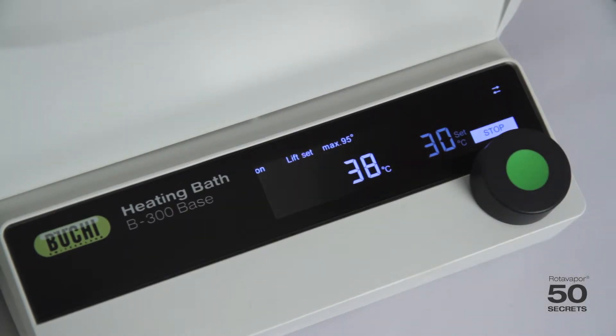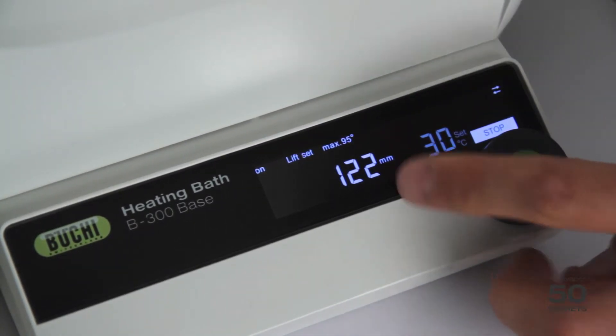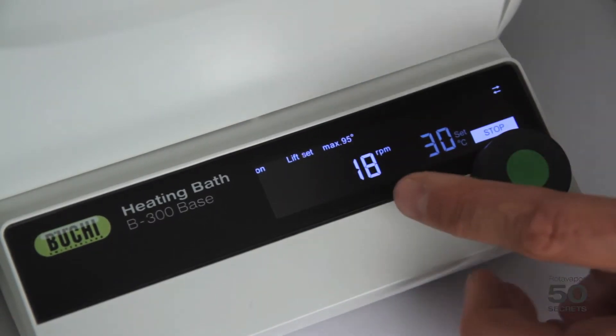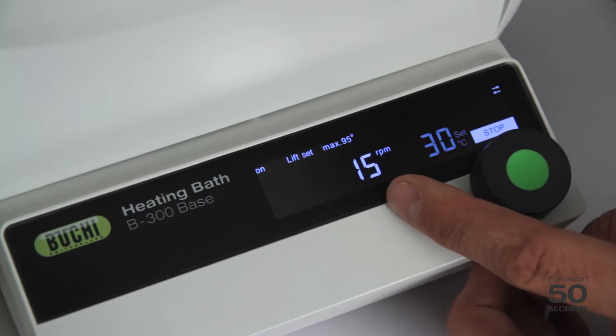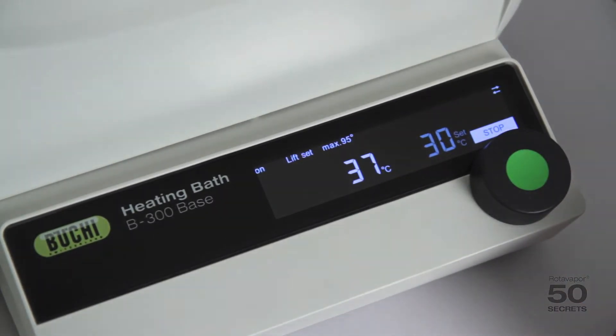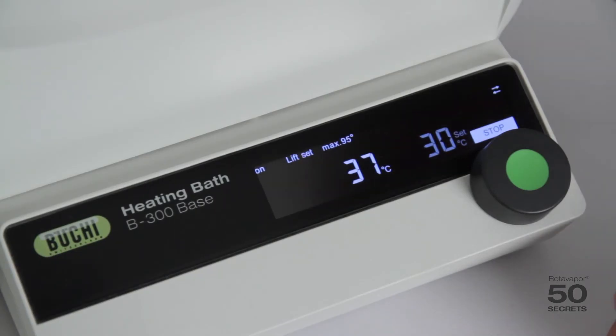If I move the lift, you can see the lift number is moving too — it shows the millimeter position. The second thing we can see is if I change the rotation speed on the handle, the rotation speed displayed here changes as well. So this is a rotation speed display.